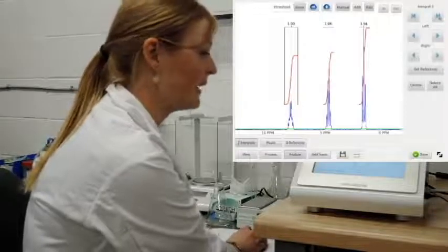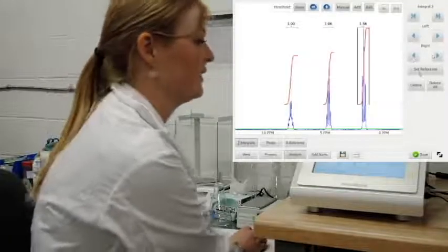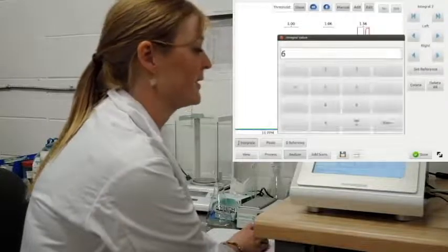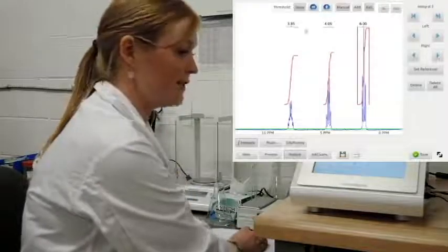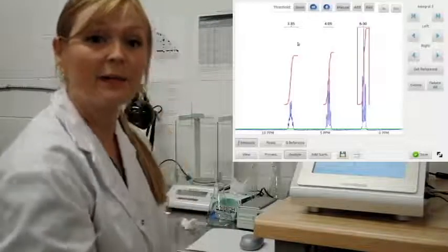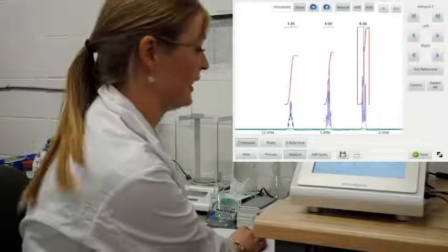If I select the edit button, I can jump back and forth between my integrals, and then I use these for fine adjustments to set the bounds of each integral. So this is diethyl phthalate. I have 2 methyl groups, so I'm going to set this reference to 6. I get an integration of 6 to 4 to 3.8, which is approximately the 6 to 4 to 4 that I would expect. If you want to do quantitative work and get a more accurate integration, you would choose a longer scan delay than I have, so more of the aromatic protons can relax.